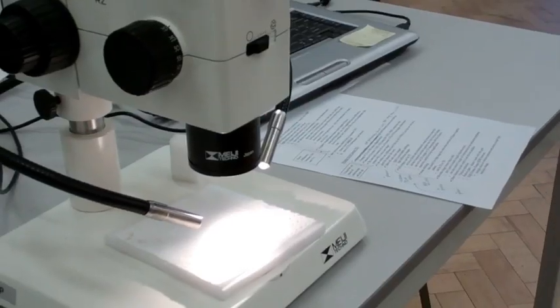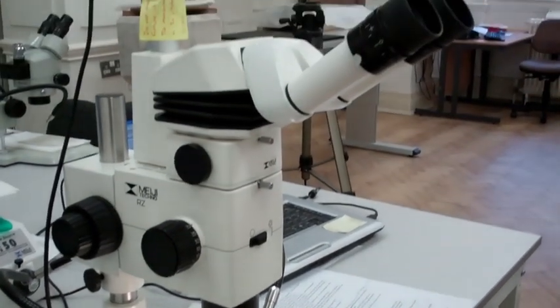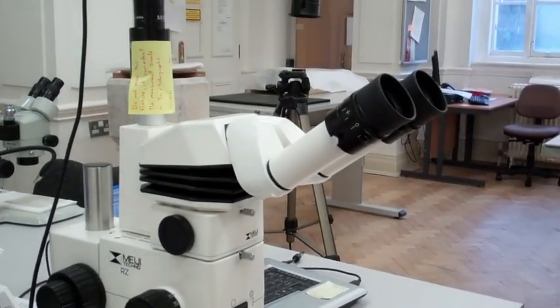This is our larger bench microscope, which has a higher magnification and goes up to 75 times. It's great because it also has a camera attached, so we can take pictures of changes in the material and the objects as we're working.